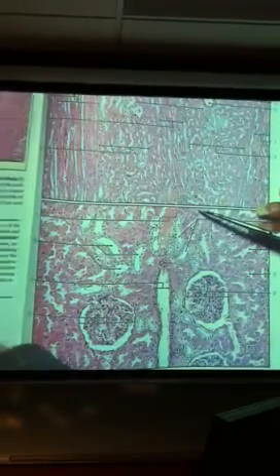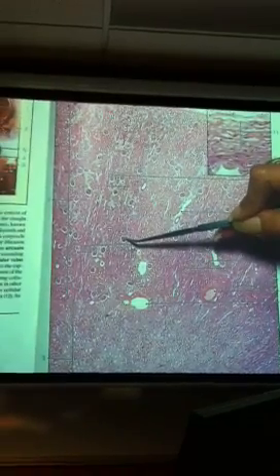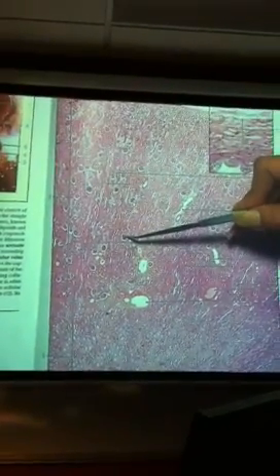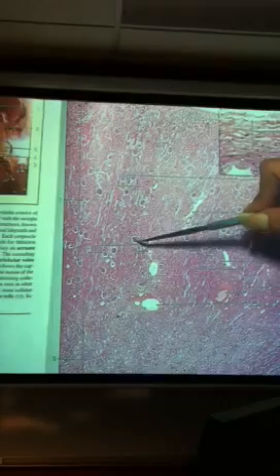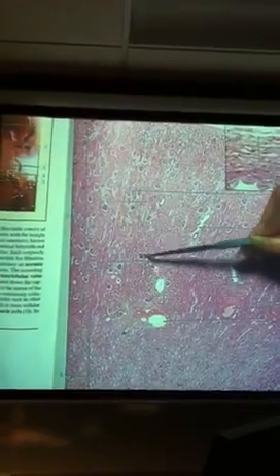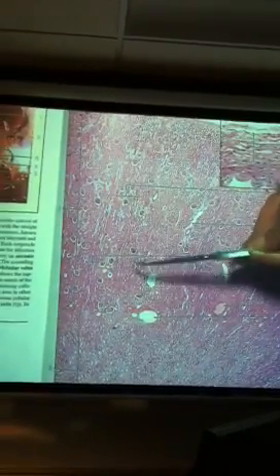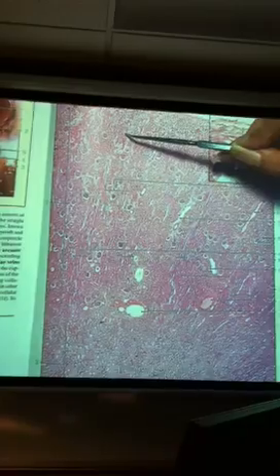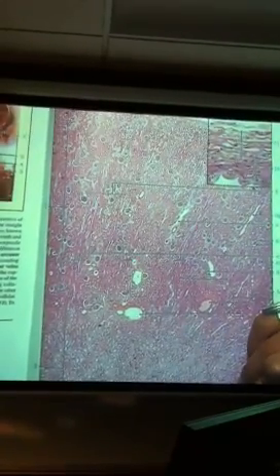A good test question would be: what is this structure? Your answer would be renal corpuscle. And where in the kidney are you? Well, if we're looking at a renal corpuscle, you have to be in the cortical region of the kidney, not the medulla. Does that make sense?